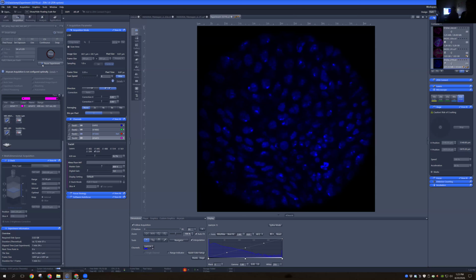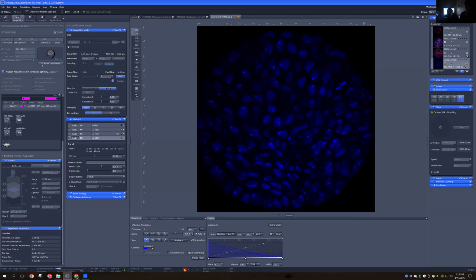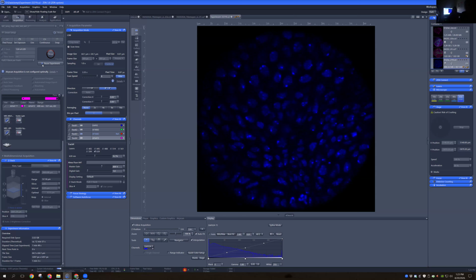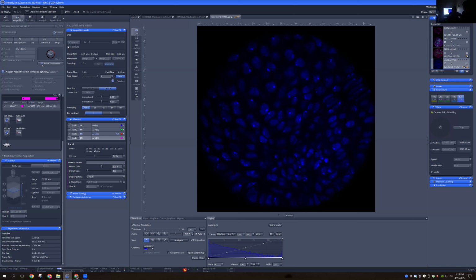Speaking as Michaela's friend, I will also say, from my understanding, her experiments really push this machine to its limits. The analysis that she's doing is really pushing the machine to its limits. As part of her experimental workflow, these are sort of the bread and butter experiments that she's doing. So to ensure she has enough instrument time, I'm quite certain she's in at least one day a weekend, if not both days, because it is a shared instrument and she doesn't want to get in the way, but occupy the instrument when it's shared by, how big is your lab? 20 people? 15. There's about 15 of us. Yeah, that at some point are using this scope.